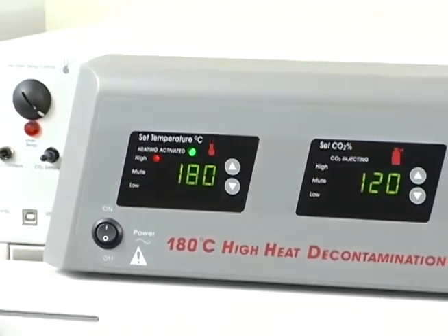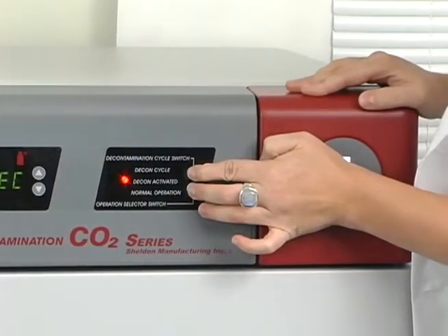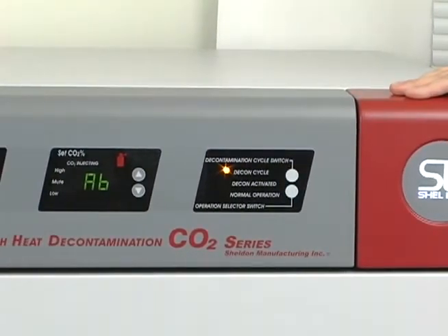In the event that you want to abort the decontamination cycle, simply press and hold both the operation selector switch and decontamination cycle switch for approximately 4 seconds. Once the CO2 display shows AB instead of DEC, you will know the cycle has been successfully aborted.